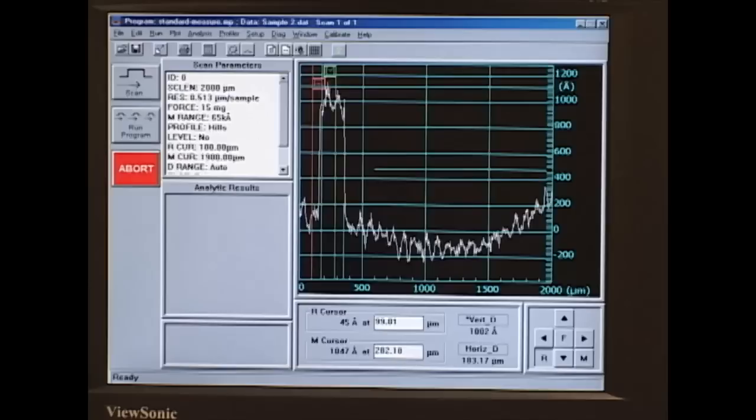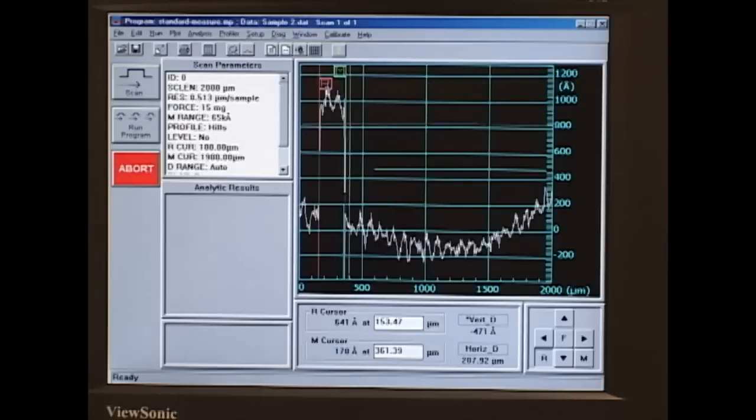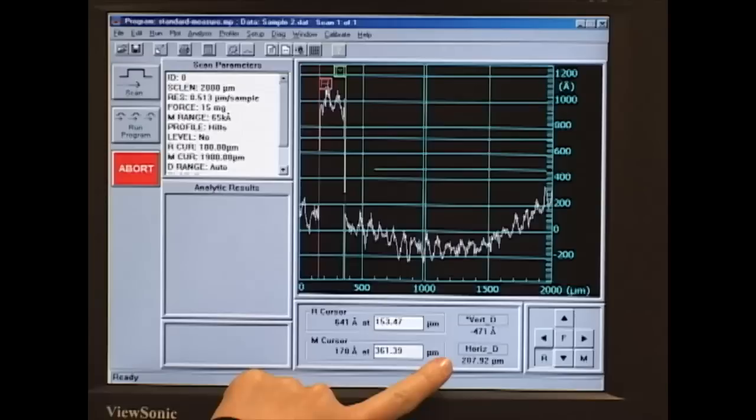We can also measure the width of our feature. We move the R line and the M lines just to the edges of our feature. We'll see the horizontal distance between them is about 208 microns.